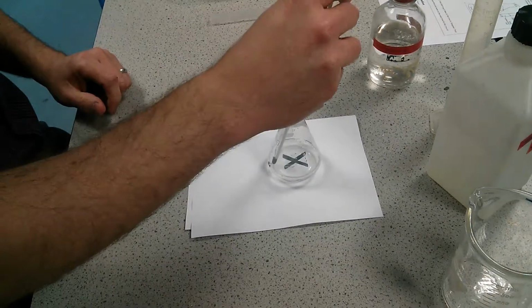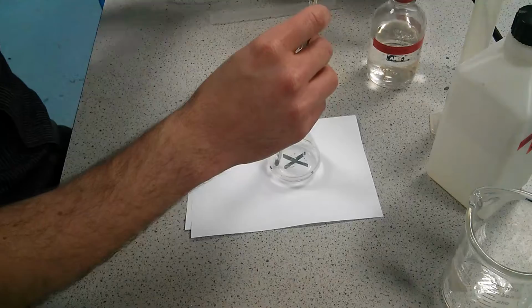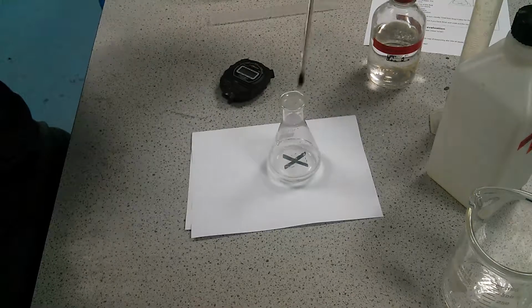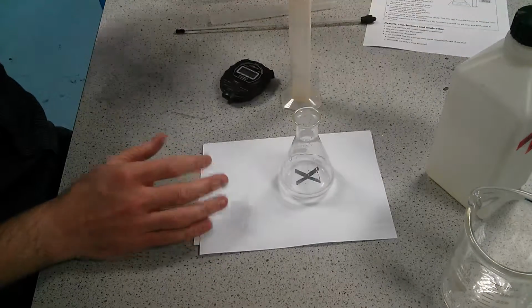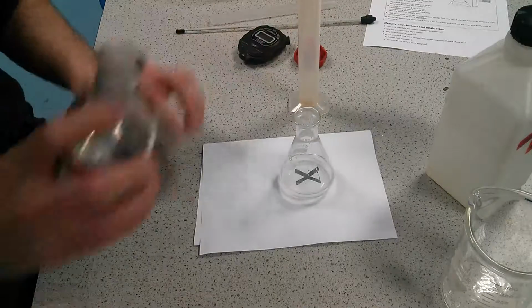And then we're going to take the temperature to start off with and write that down onto our results table. We're going to do it at room temperature to start off with. So we've got our table there. Okay, and that is 20 degrees centigrade. Then we're going to measure out 5 cm³ of hydrochloric acid.